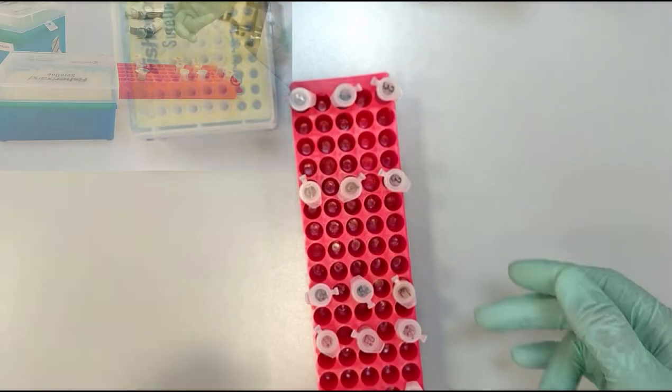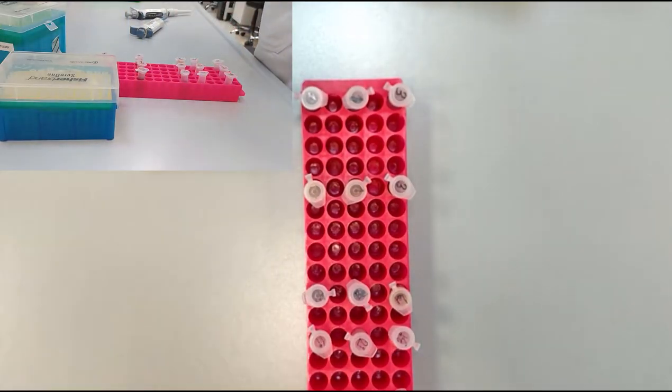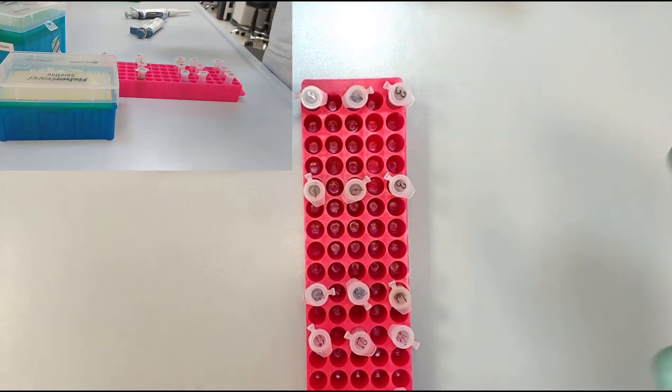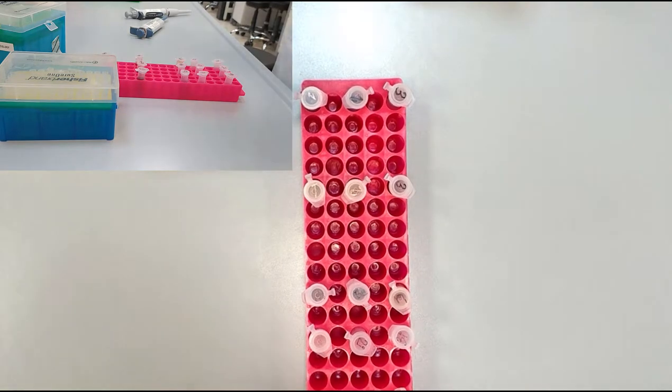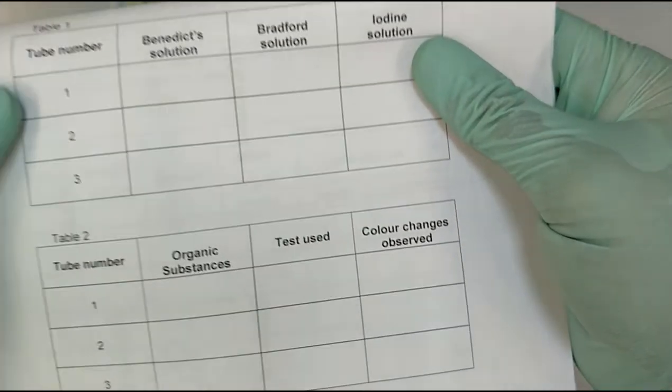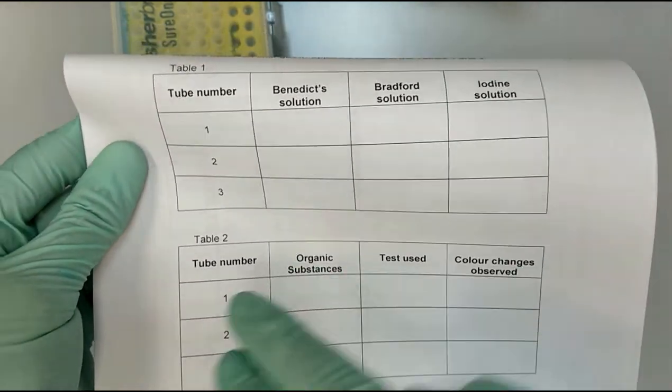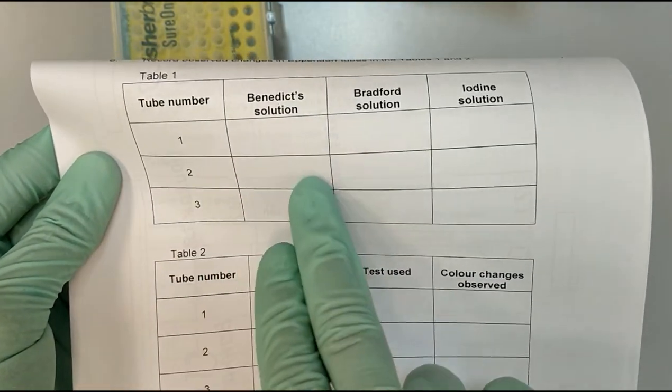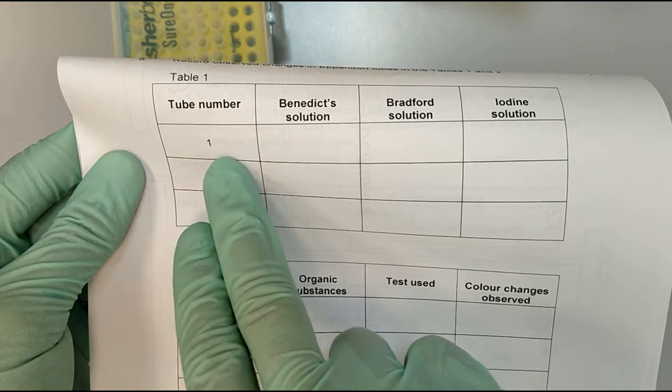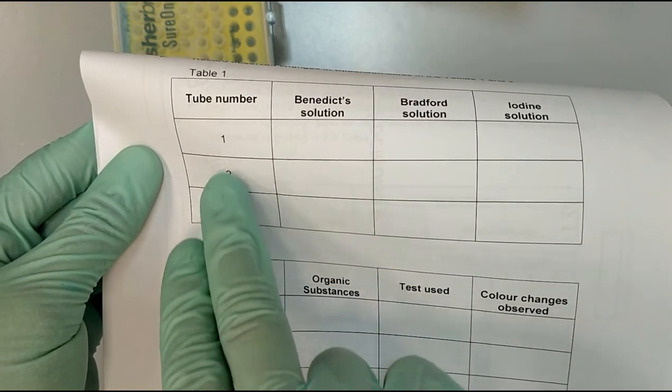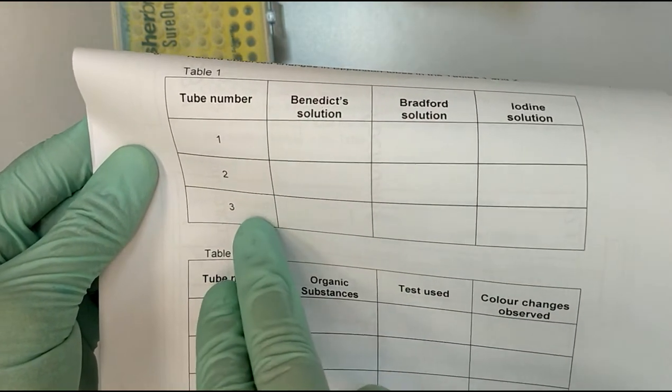Now what we are going to do, we are going to write down the results. For the results we have a special table in your manuals. For example, for table 1 you are going to write down the tube number as 1, 2, 3, so these are the secret solutions.